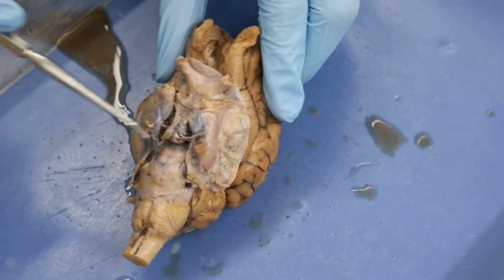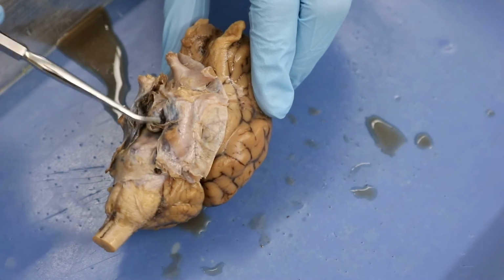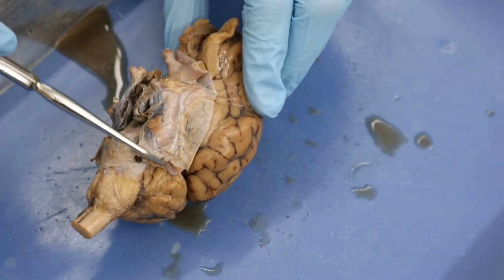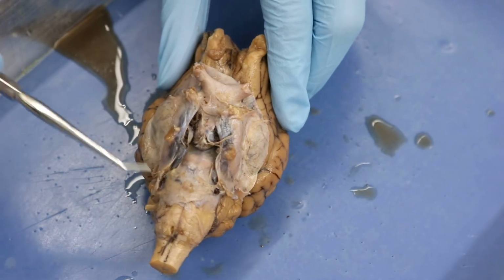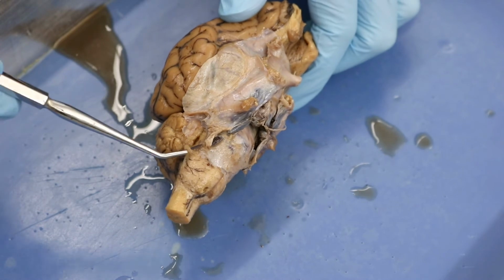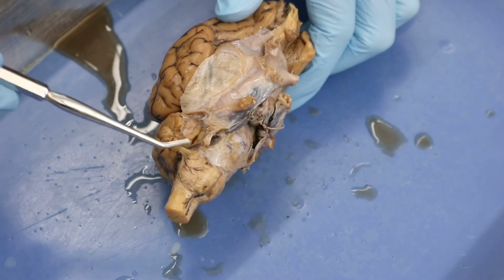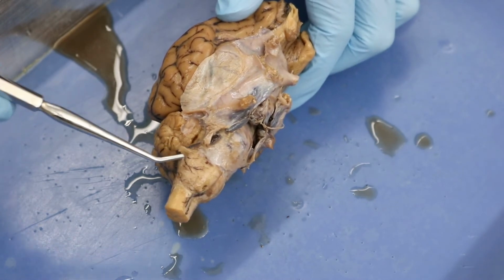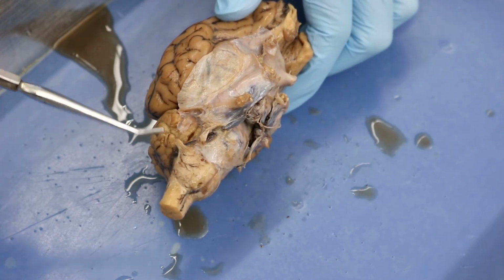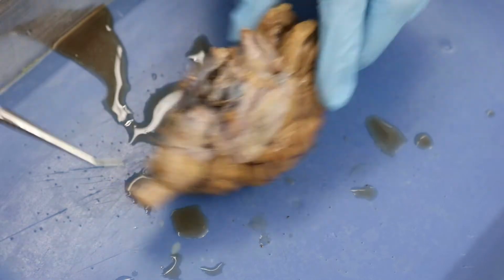We can also see, or maybe we can't. Yeah, I think we might have to cut away some of this to see many of the others. We do have this little guy over here, and this little guy is probably 9, I would think, but it's hard to tell for sure, okay?